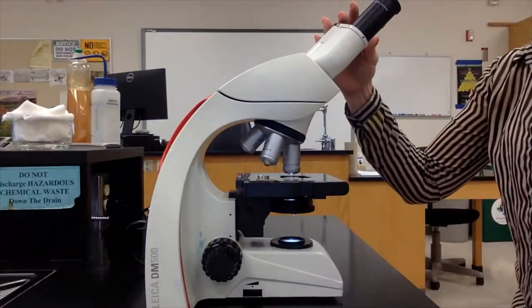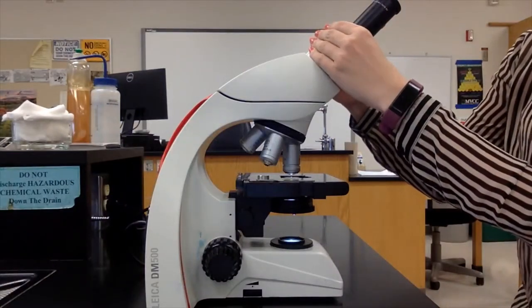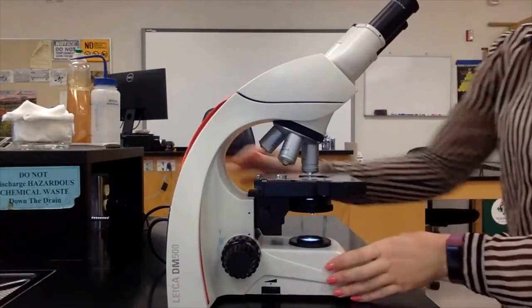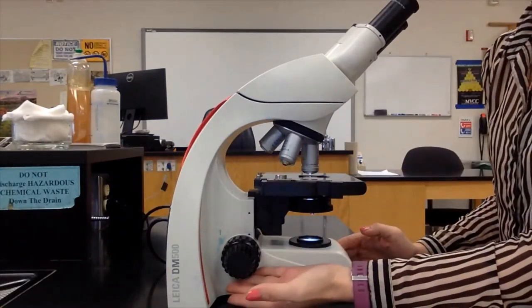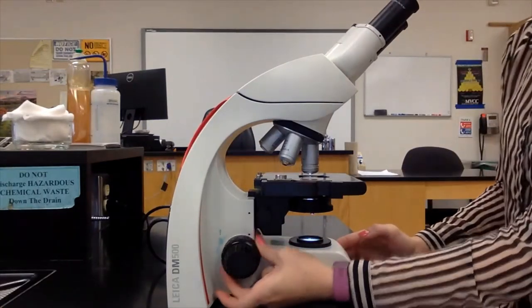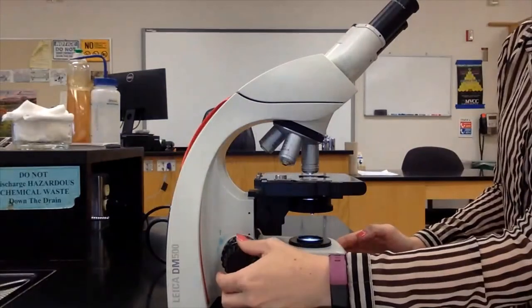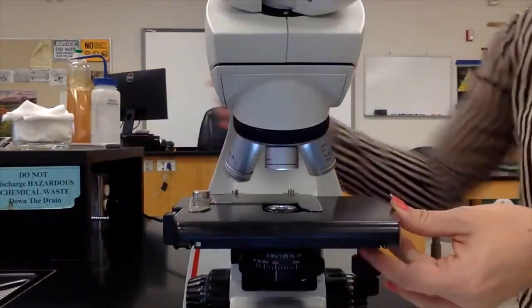We also have our ocular lenses up here. Here we also have the coarse adjustment, but on this microscope it also has a fine adjustment knob here.